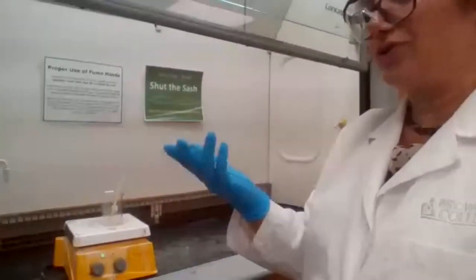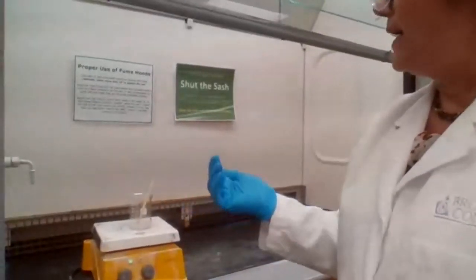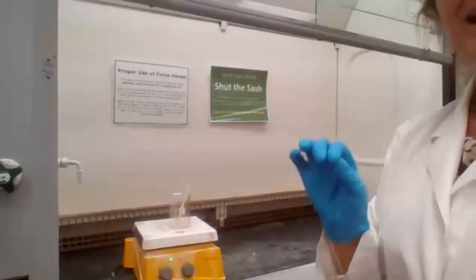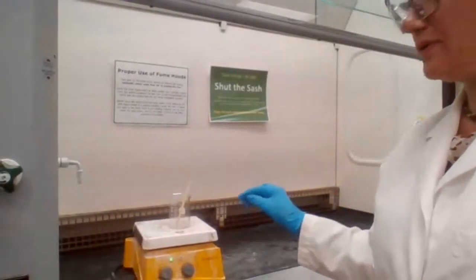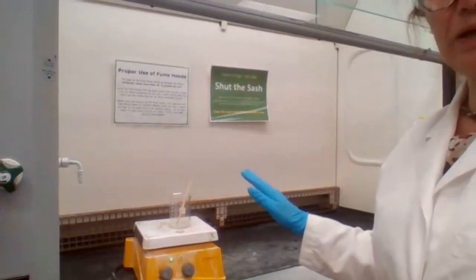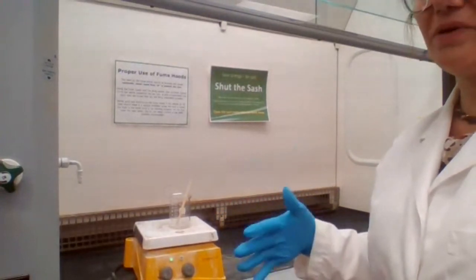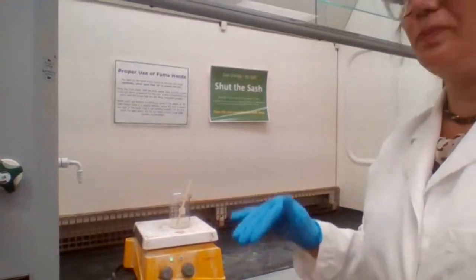If I get a lot of product, you would get about 10 drops of the product. The color is another indication. When you see a light tan color, you stop heating. If it turns yellow, dark yellow, or brown, that means you burned the product. Let me get your question.